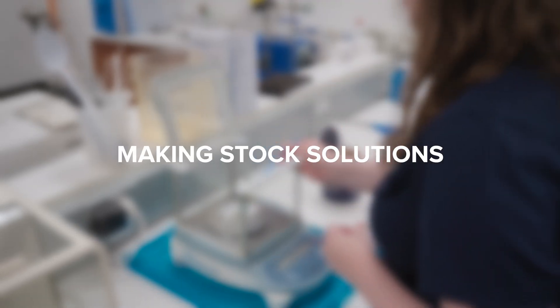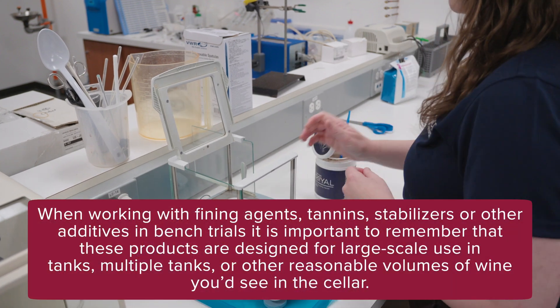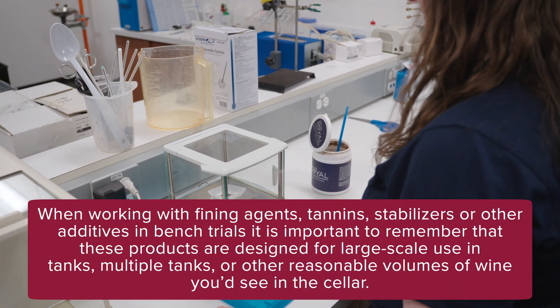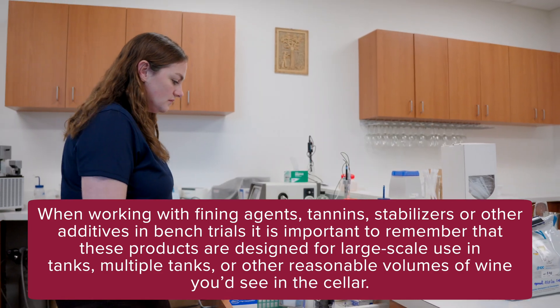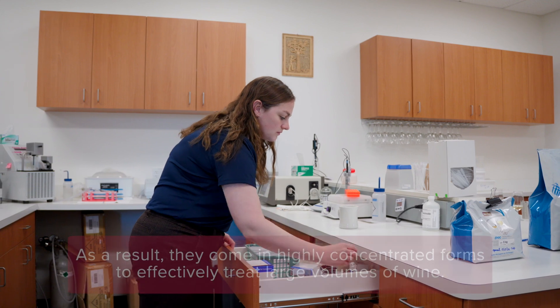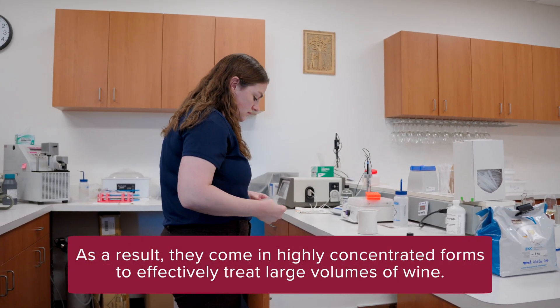Making stock solutions. Why prepare a stock solution? When working with fining agents, tannins, stabilizers, or other additives in bench trials, it is important to remember that these products are designed for large-scale use in tanks, multiple tanks, or other reasonable volumes of wine you'd see in the cellar. As a result, they come in highly concentrated forms to effectively treat large volumes of wine.